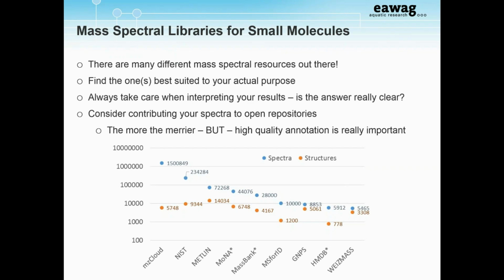The reality is that none of the collections have actually started having a significant amount of spectra yet. Again, this gets back to my point. Consider contributing your spectra to help get it started. Yep. But I imagine a lot of these vendors are also taking care of that. So the first thing you're going to get is actually a vendor library.